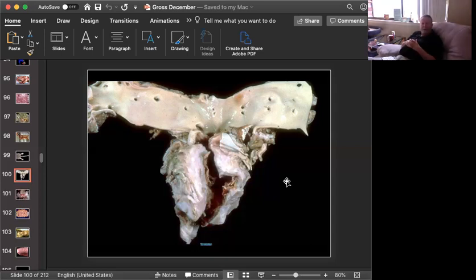You can have small intimal streaks in a lot of vessels, but where they come to roost, they do a lot of damage. They strip the endothelium. You have thrombosis. You have granulomatous inflammation. You have some eosinophils, because they are nematode parasites as well. And you get the formation, due to a weakening of the wall of this vessel as well as turbulent flow and thrombosis, you get the formation of a pseudo aneurysm.